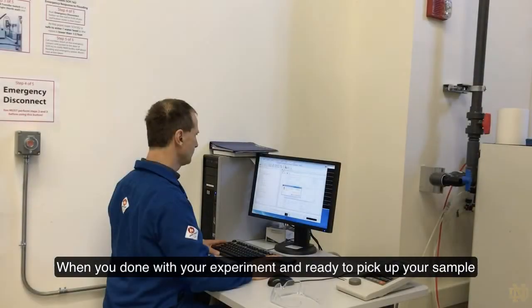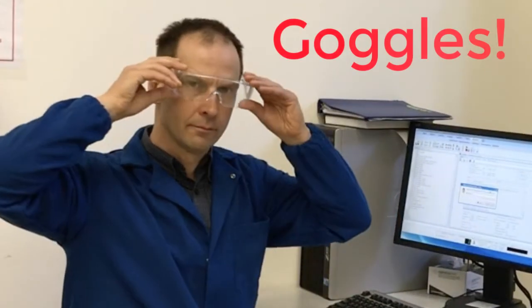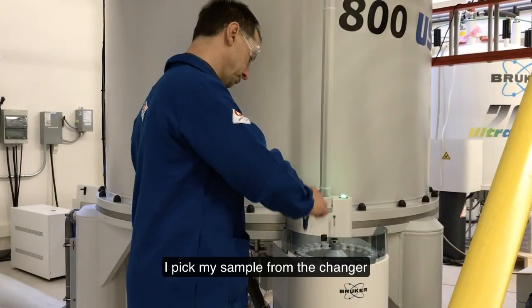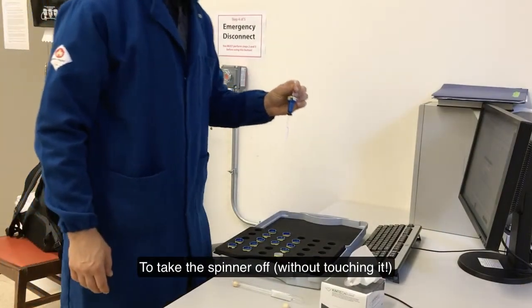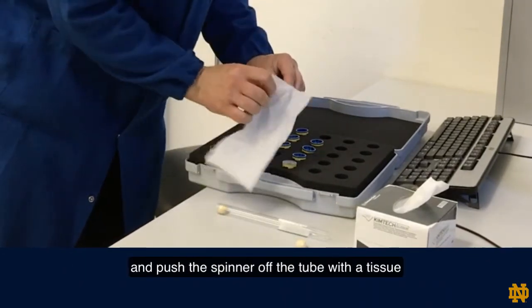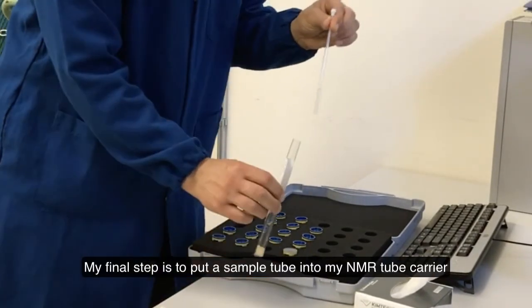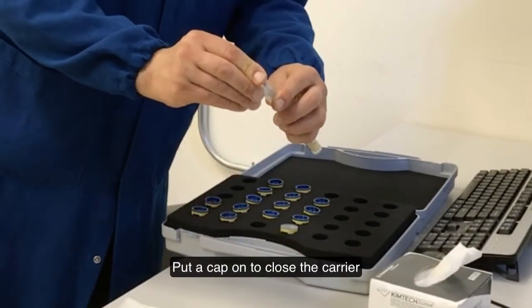When you are done with your experiment and ready to pick up your sample, the first thing to do is to put on your goggles. I pick my sample from the changer. To take the spinner off without touching it, I take a tissue, point my tube into an empty slot in the spinner rack, and push the spinner off the tube with the tissue. My final step is to put the sample tube into my NMR tube carrier and put a cap on to close the carrier.